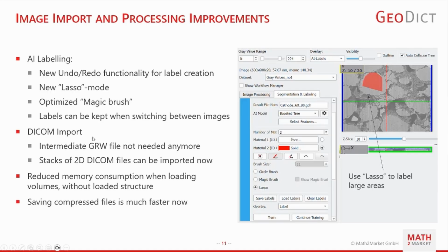Additionally, the new version supports a direct import of DICOM files. Previously, you needed to use other tools to convert the DICOM files into something that GeoDict could import. Now you can directly load them into GeoDict.